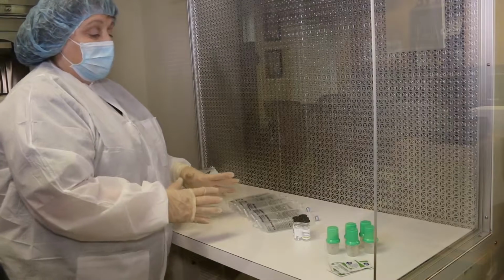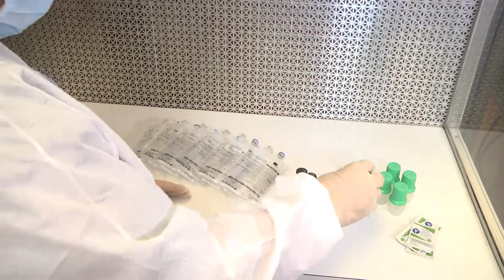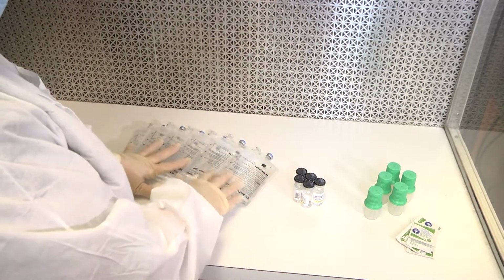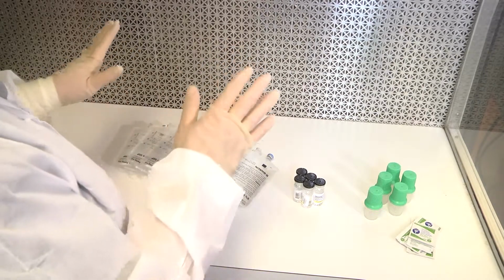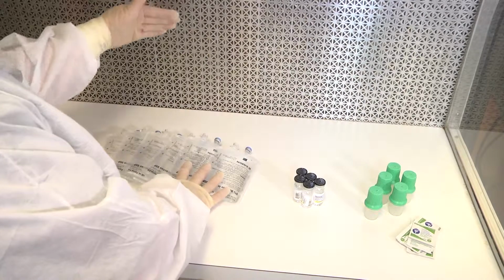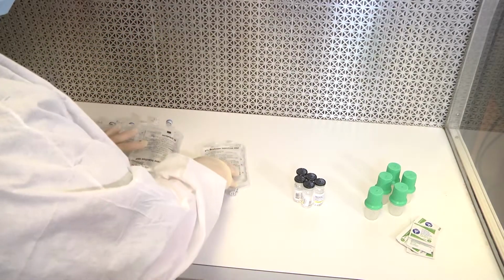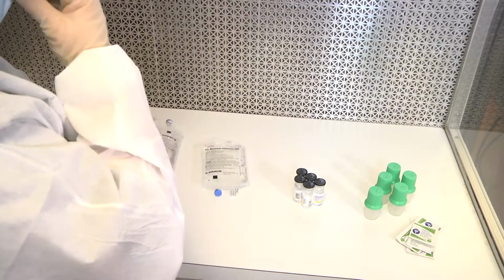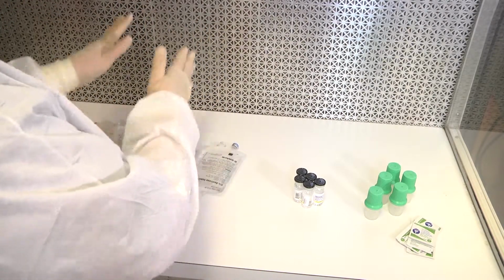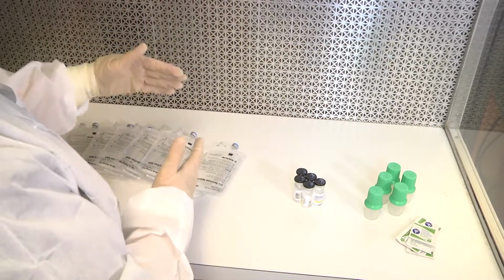Okay, now I would like to show you how to use what's called an Add-Ease vial topper and how to make a batch of IVs with Add-Ease. So first I'll have my IV bags. They have to face the HEPA filter with the air blowing on them. If I turned it this way, it would be improper airflow. So all the tops of the IV bags need to be in front of the HEPA filter with the air blowing at it.